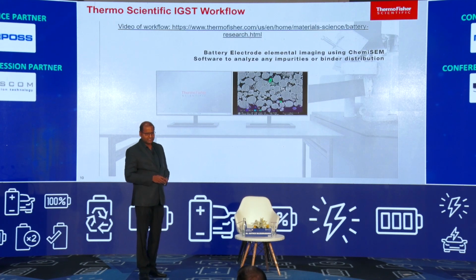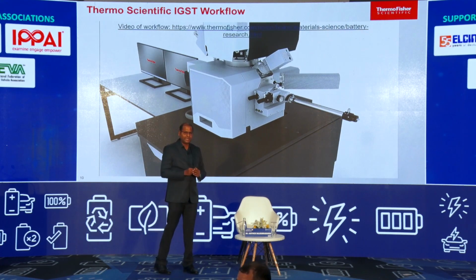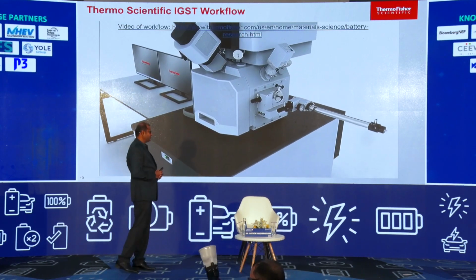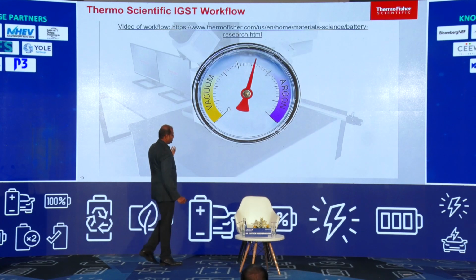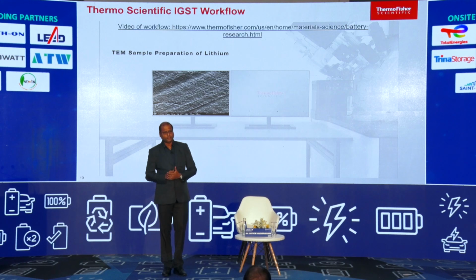And in order to understand the composition of lithium, it is also possible to attach a time of flight SIMS to the chamber. The SIMS helps you to understand the presence of lithium, and by identifying the right areas, you can transfer the sample not only from an SEM, but it can also get into a dual beam.